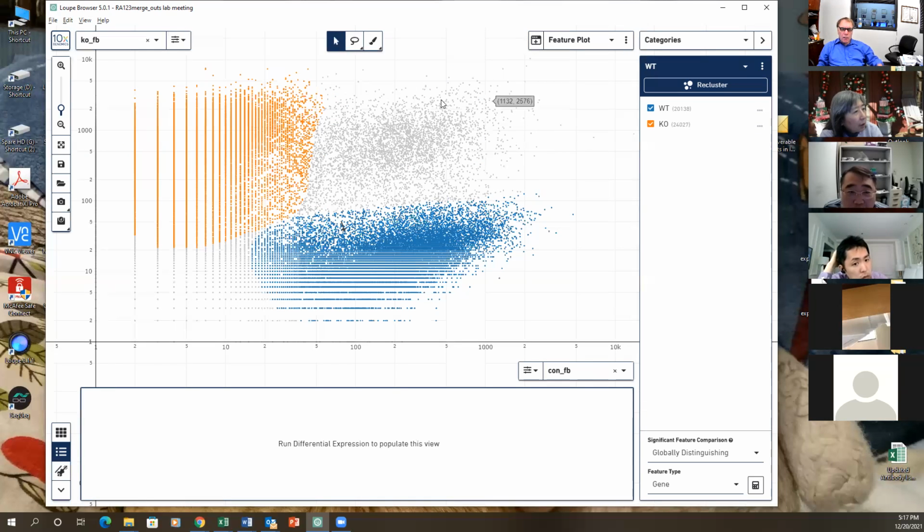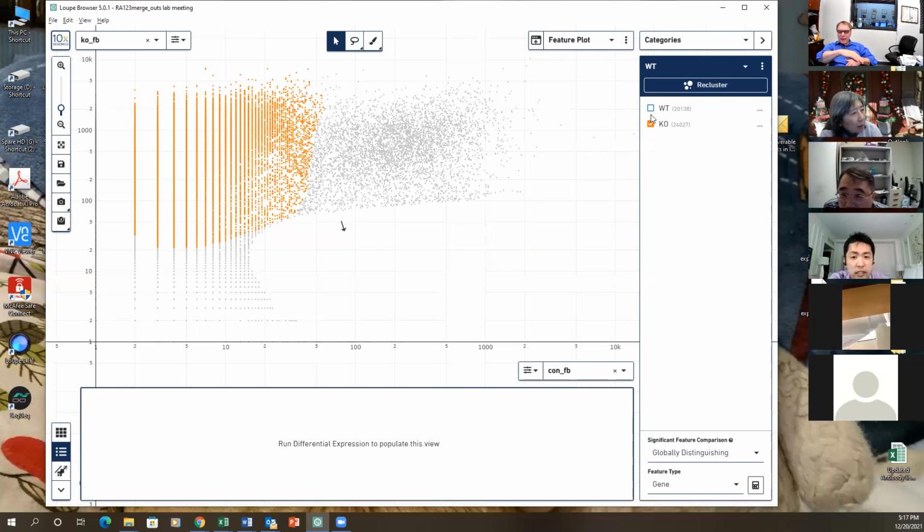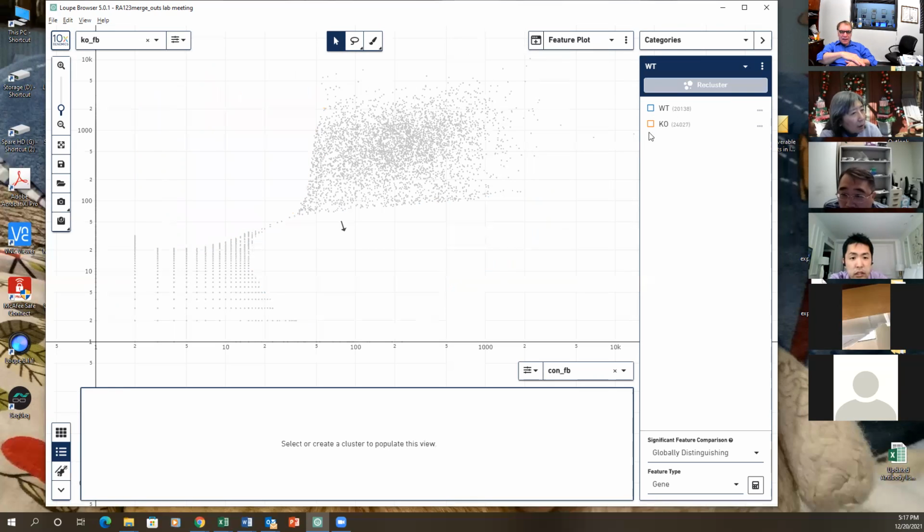Huishen, you don't have to go. Wait, go back to your desk. Okay, Huishen, that's okay. You can just stay here. Okay, you uncheck WT, knockout. Uncheck. Just uncheck. Yes, uncheck knockout 2.